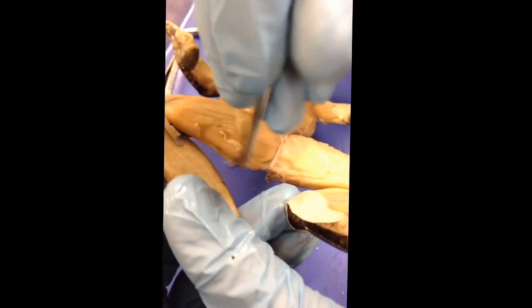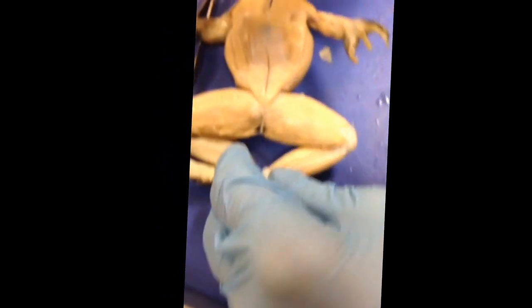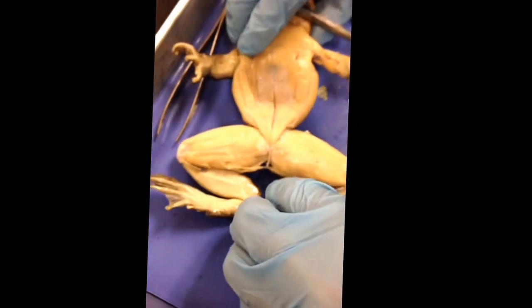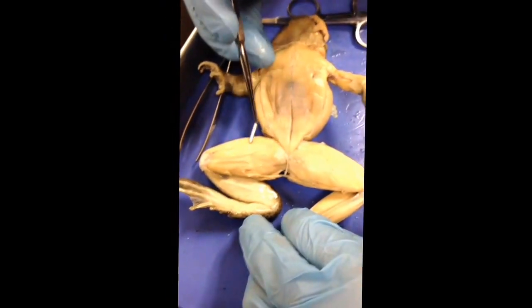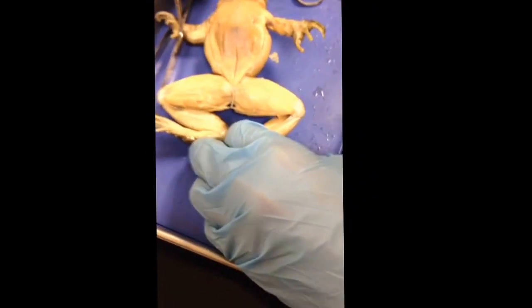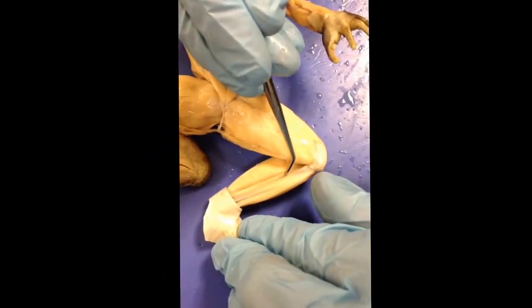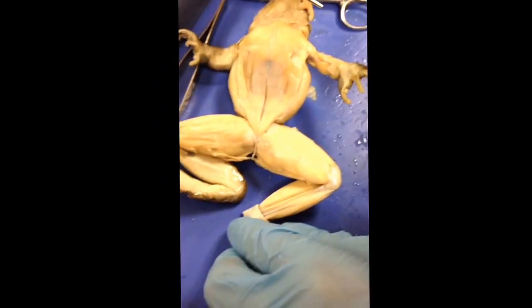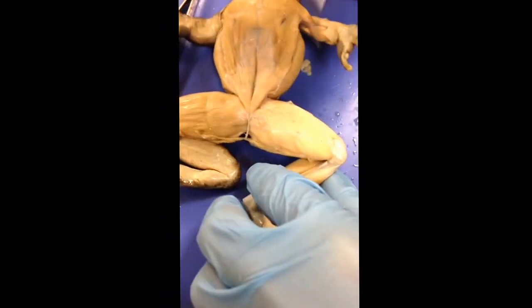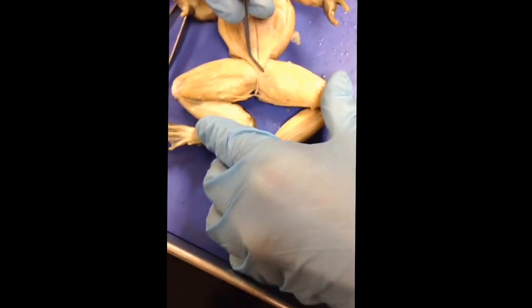Which is the small flap beneath the major. The next one is the sartorius. The next one is the tibialis posterior. The next one is the adductor magnus. And the very last one is the vastus externus.